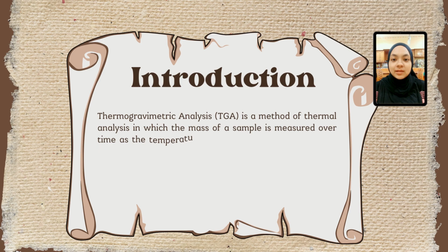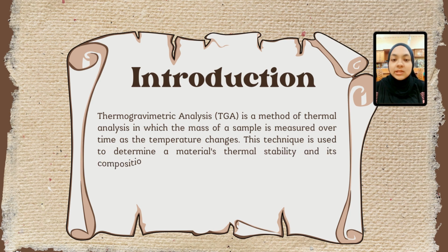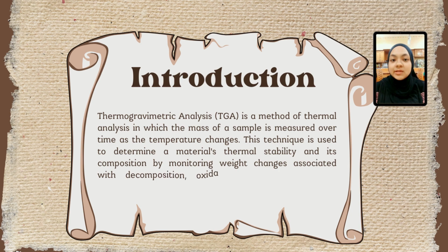Today, I would like to present about thermogravimetric analysis (TGA). I will share a little bit about the machine, including what is thermogravimetric analysis, the process to operate the machine, and also the advantages and disadvantages of the TGA machine.